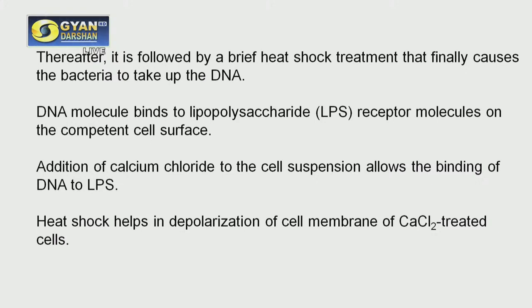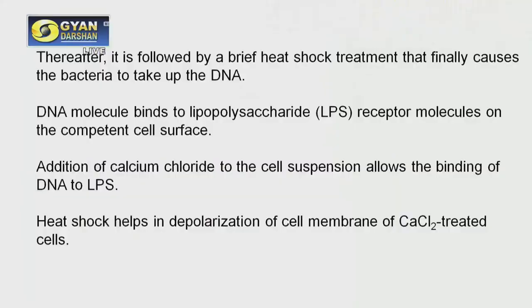So DNA molecule binds to such lipopolysaccharide, and addition of calcium chloride to the cell suspension allows binding of the DNA to the lipopolysaccharide. And this brief heat shock actually creates depolarization of the cell membrane of calcium treated cells. So calcium treatment, creation of pores, followed by heat shock, which creates depolarization of the membrane, and altogether they facilitate the entry of the DNA molecule within the cell.